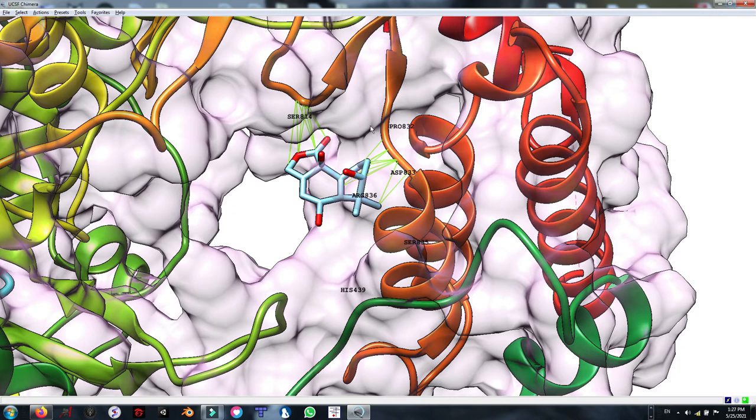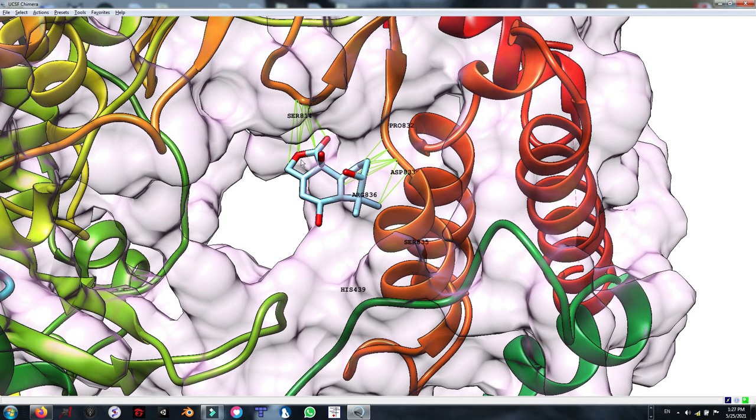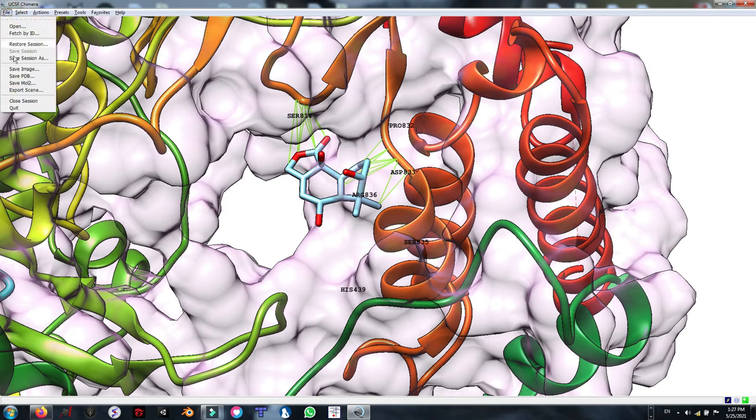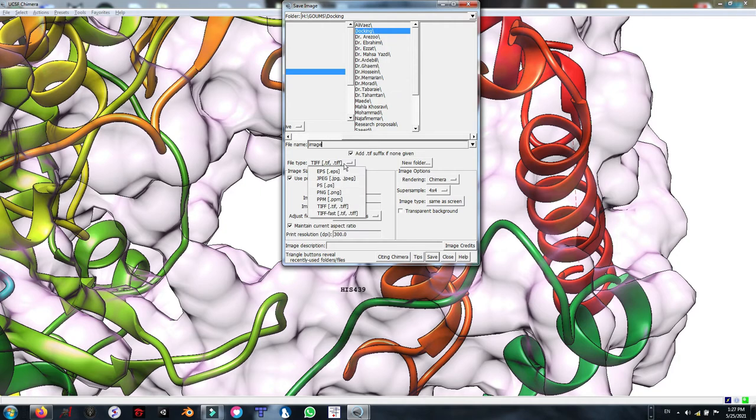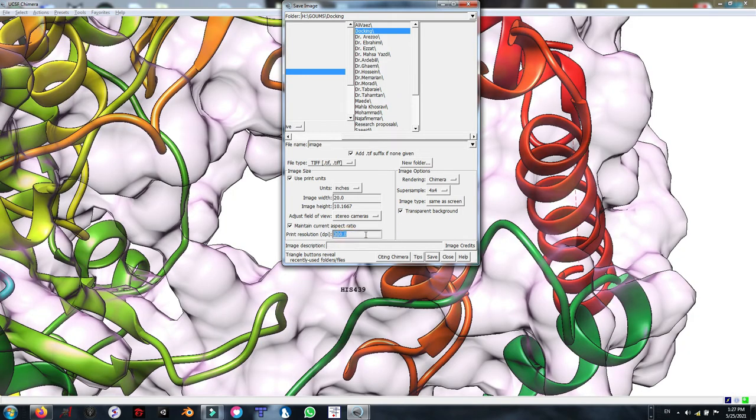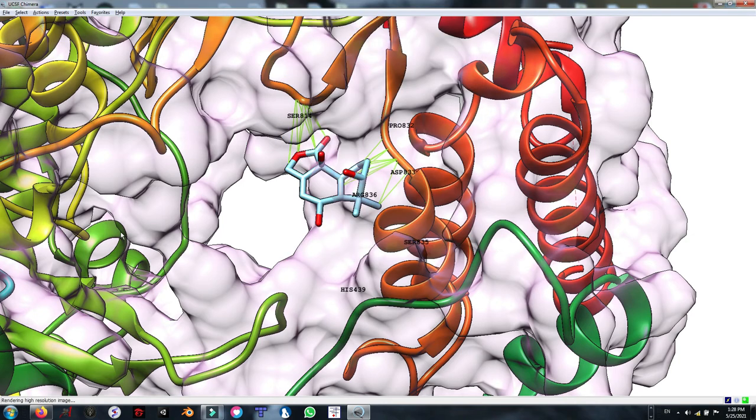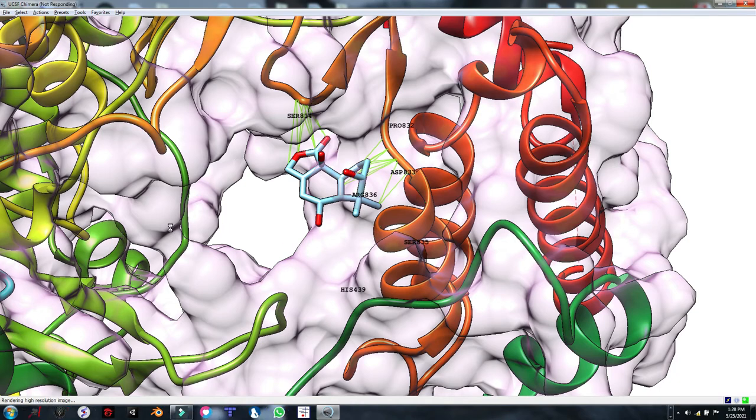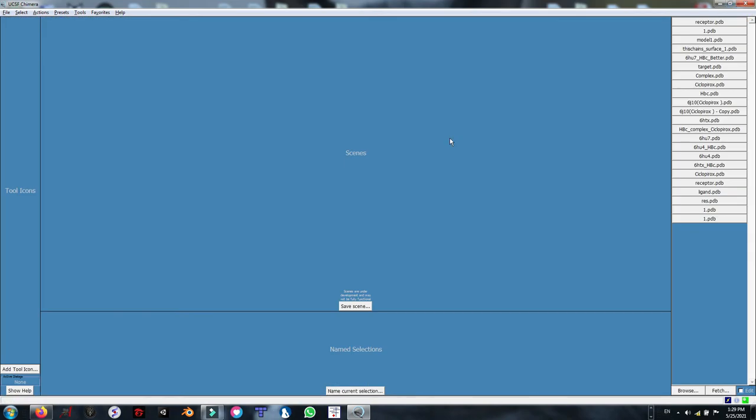Now I'm going to save this view as a figure with TIF format. I can select any other format supported by the UCSF Chimera. You can name it whatever you want in your directory. We were somewhere else, and don't forget to check this transparent background and also define your resolution. I'm going to check it at 300. Then click Save. It will take a few seconds to render the high resolution file.